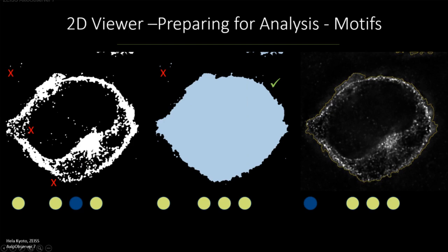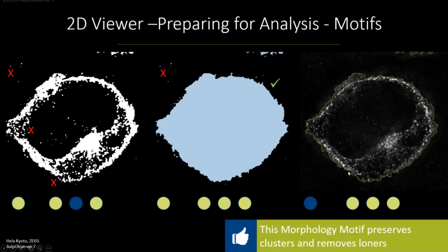And now what we get is something that's starting to look more accurate. We're following the contour of the real thing that we see in the image. And that's what's really important, right? We don't want to generate some kind of fake result. We want the borders around the objects to really snug up, hug real objects in the image.